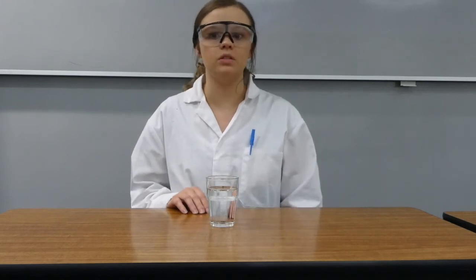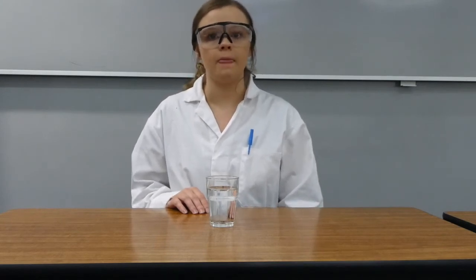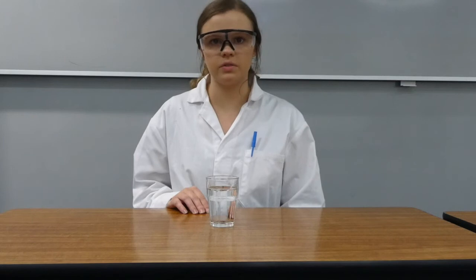AAS is commonly used in the medical industry to find evidence of important trace elements or poisonous substances like lead in the bloodstream. Due to its fast and precise nature, AAS is also used to maintain the composition of a substance and rule out possible contamination. Because of its ability to do so, AAS is used to measure the quality of water, hence why we should use it.